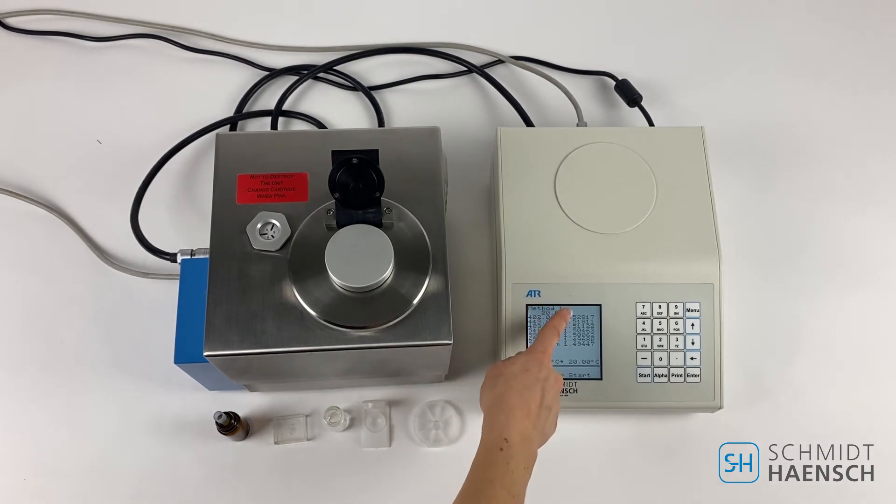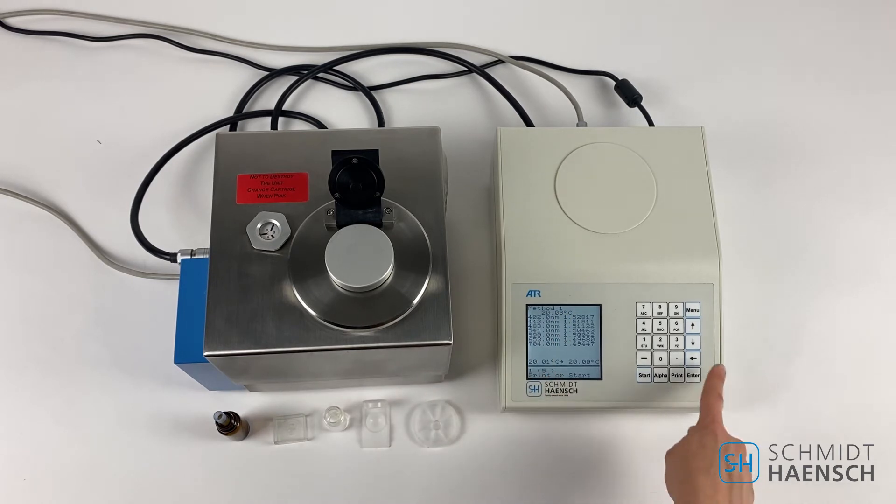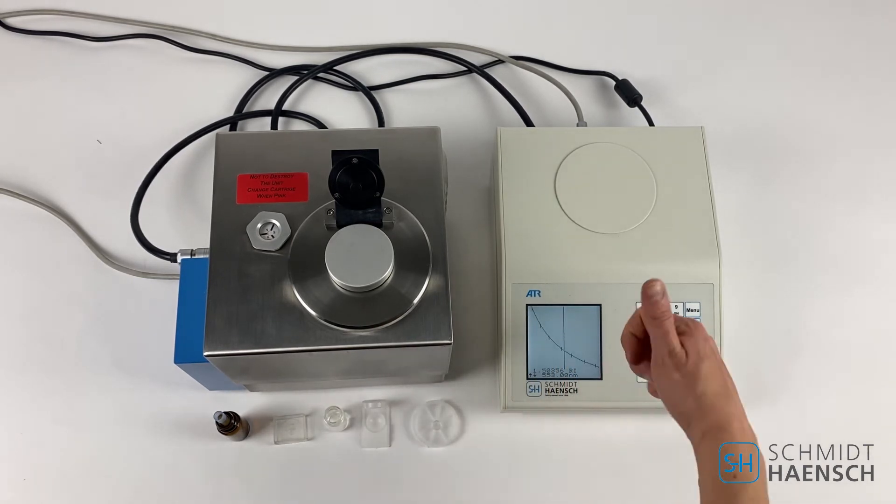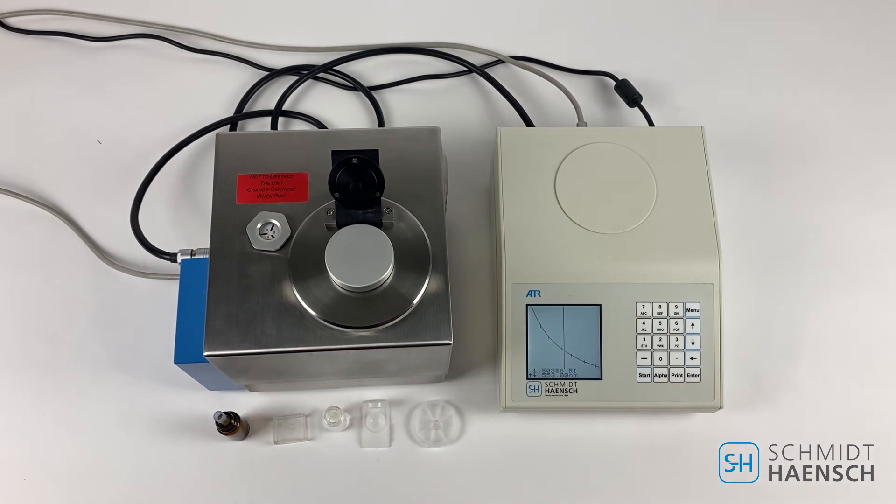The measurements show wavelengths on the left, refractive indexes on the right. Visualize the results to see the dispersion curve. The measurement has been successful.